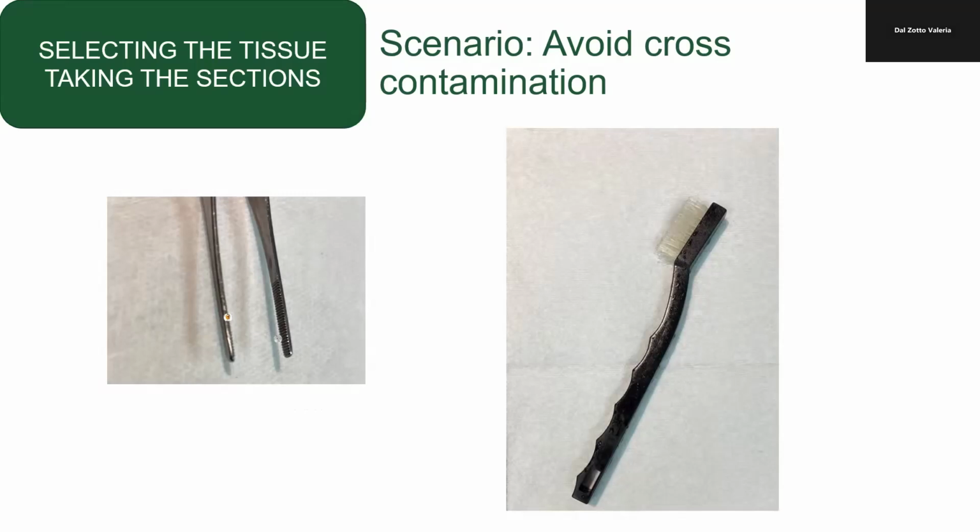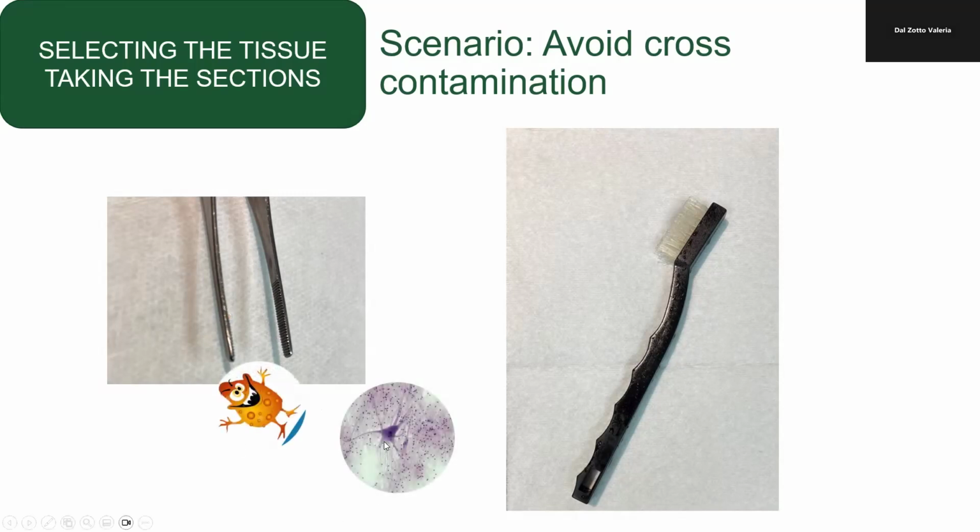Another thing that you have to do: this is the famous brush that you're going to find on your table. You're going to be provided with a brush, and the brush is used to clean. Every time that you finish one specimen, you have to brush your tools, especially the forceps, because within the ridges of the forceps, sometimes there are pieces of specimen from the prior case. You don't want to contaminate the current case with the prior case. So make sure that you brush your tools when you change specimens.